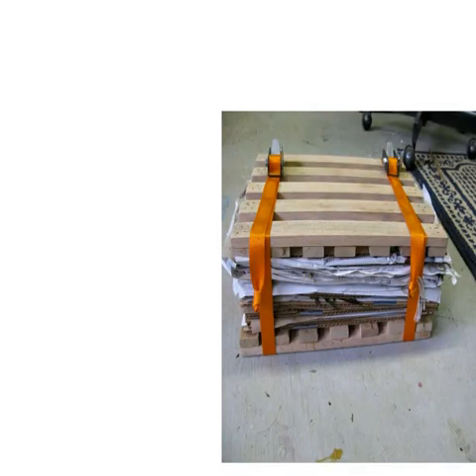With us here is a typical plant press. You can see there's this wooden portion. The upper and the lower portions are wooden. We are having a strap. Then within the plant press we have a ventilator. After the ventilator we have a blotter. After the blotter you have a specimen, then the blotter, then the ventilator. And the same arrangement repeats or recurs. So this is how plants are arranged within the plant press.